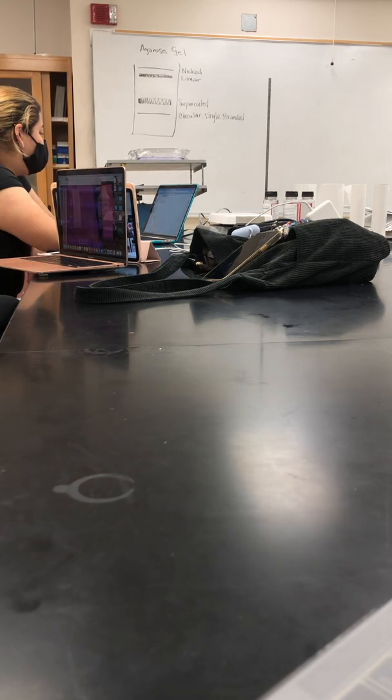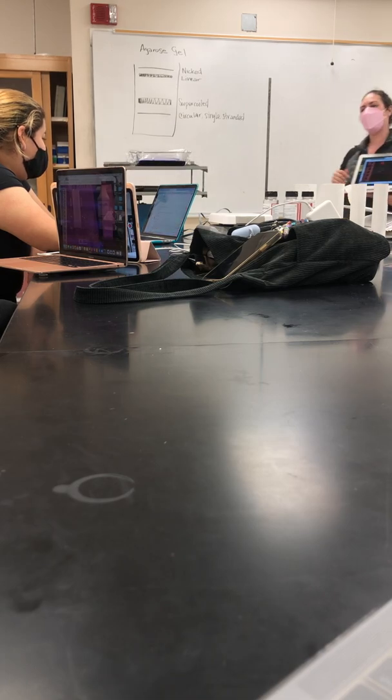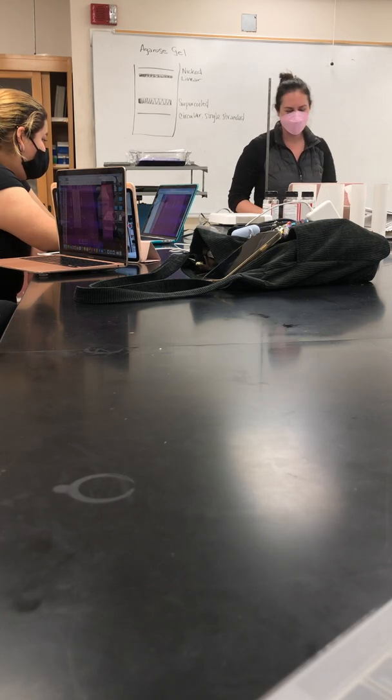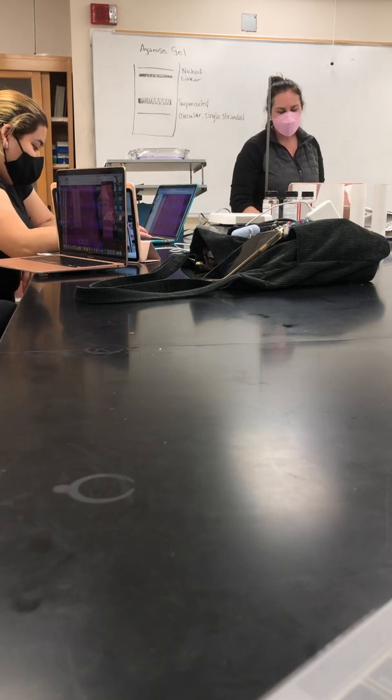Yeah. This one is acrylamide. The acrylamide, sorry. You can see it on the acrylamide, not the other band. You can see the 1, 2, 3 on the acrylamide. I now see the 3 bands. Yes.